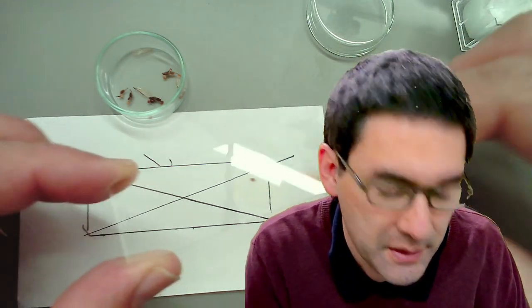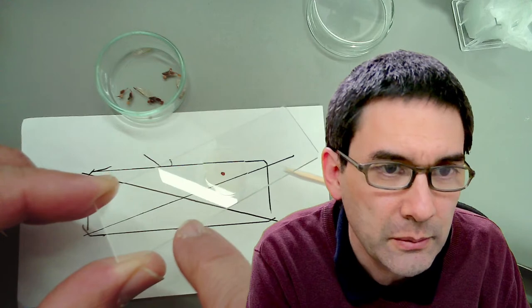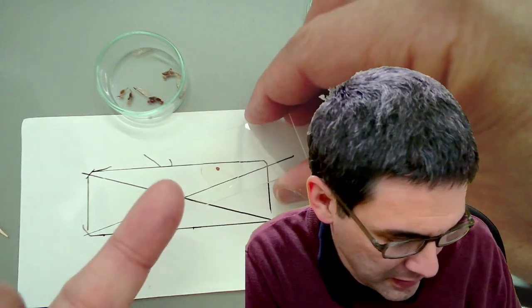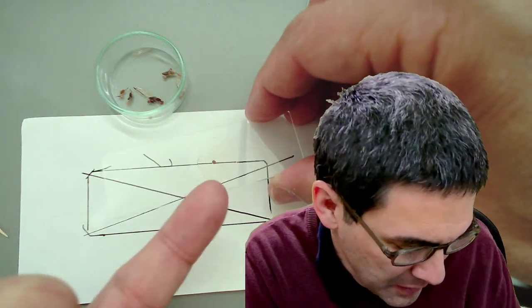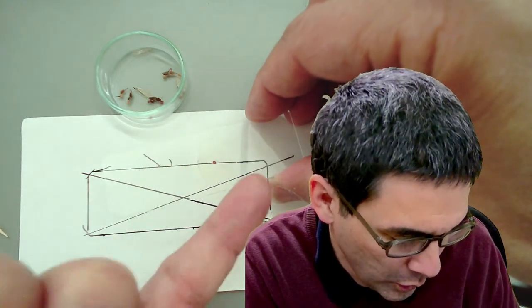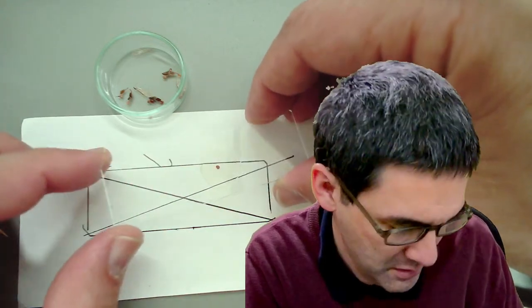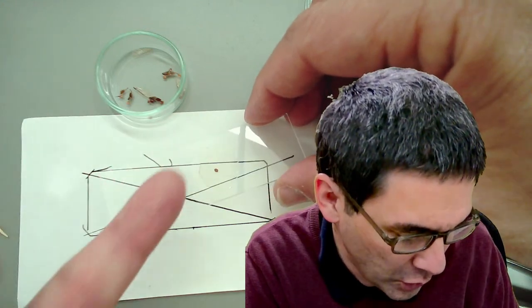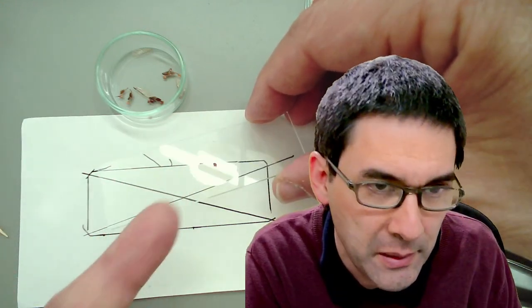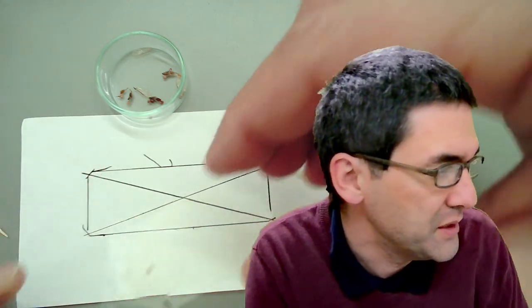And sometimes the mounting medium will not, maybe you're not able to see this quite well here, but sometimes I use too little mounting medium, especially if the specimen is thick, and then the mounting medium does not cover the whole cover glass. That's okay. What you can do later on when it's dried, you can always add a little bit using a small pipette. You can always add a little bit of mounting medium to the side for cosmetic purposes.